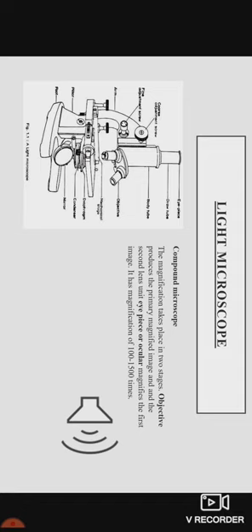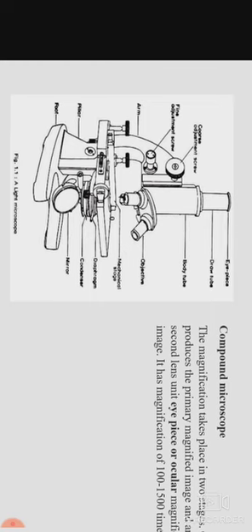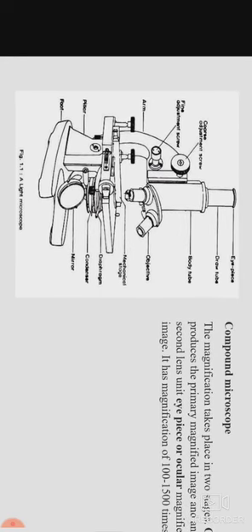The light or compound microscope is a strong heavy metal instrument. We are talking about the structure. It comprises a U-shaped base having 2 vertical pillars. A curved arm is movably joined to the pillars to hold the microscope. The arm can be bent over the pillars at the inclination joint, whatever is comfortable for the viewer.